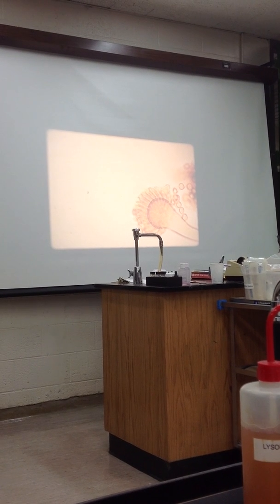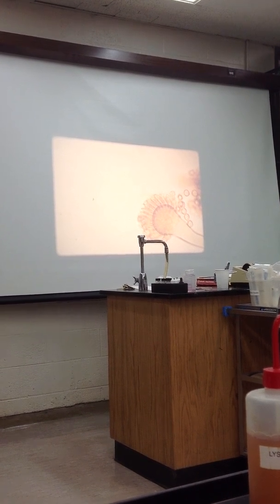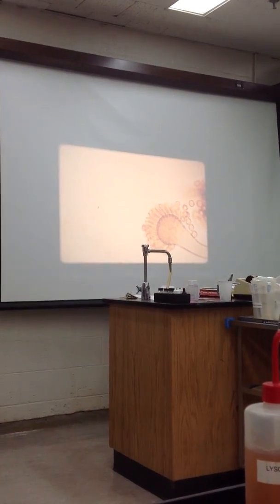What kind of mold would look like that? That's an Aspergillus, right? That's an Aspergillus.